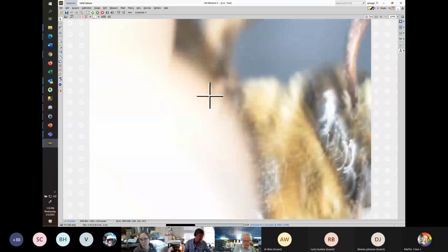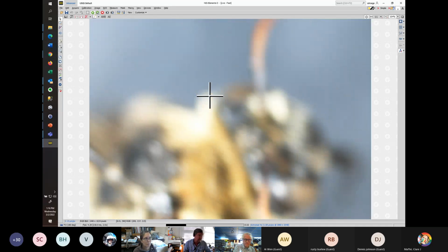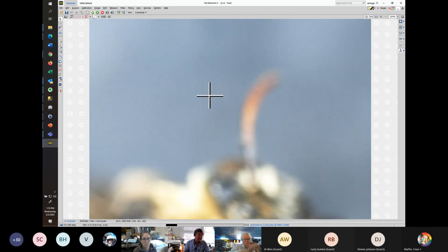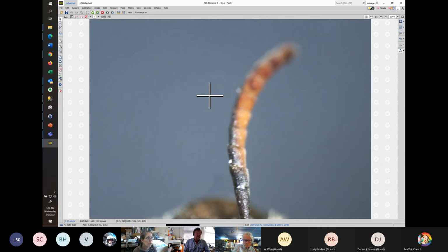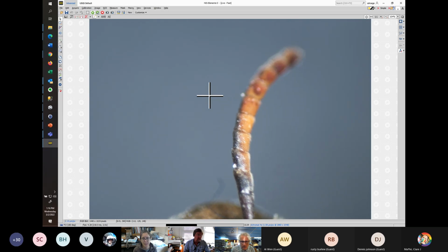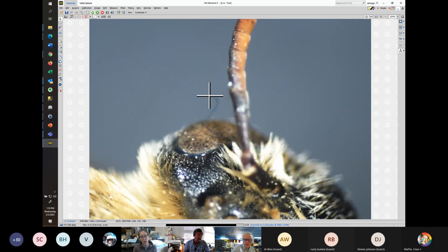See, let me tilt this a little bit more. And coloradensis is also a very big bee for Melissodes. So it sticks right out in that it's so big. But see how that F2 is longer than wide?